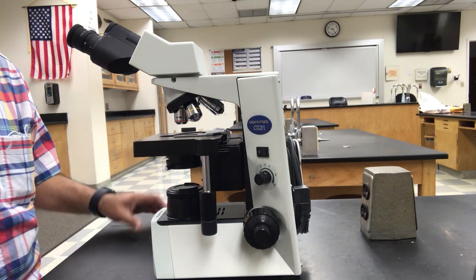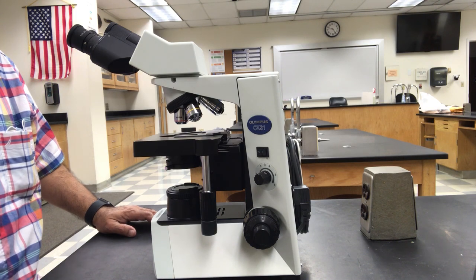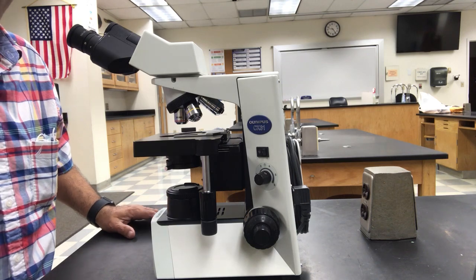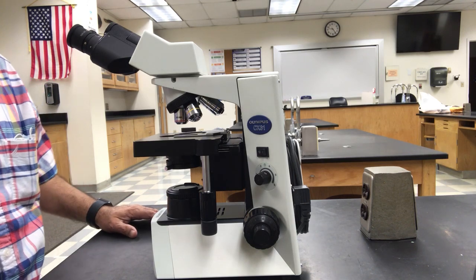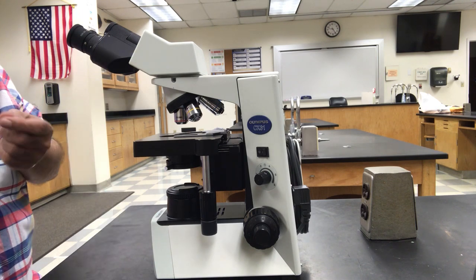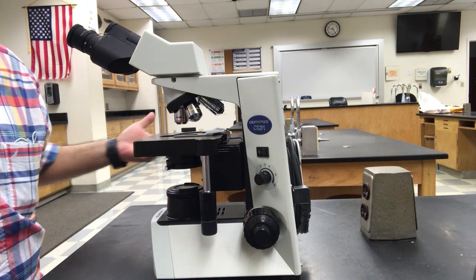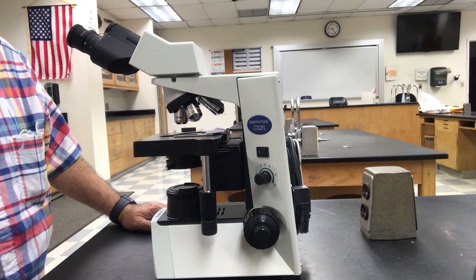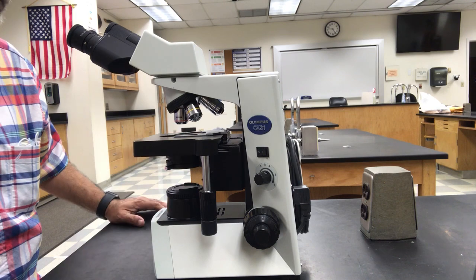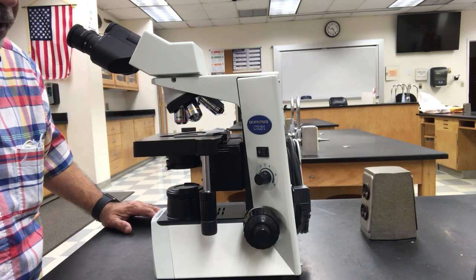Today I'm going to give you a quick overview of the microscope. The microscope is used obviously to look into very small structures that you cannot see with your naked eye. So it lets you see very small things, like bacteria, virus, and whatnot, cells. This is a very important instrument for any science student, be it in anatomy, biology, microbiology, etc.